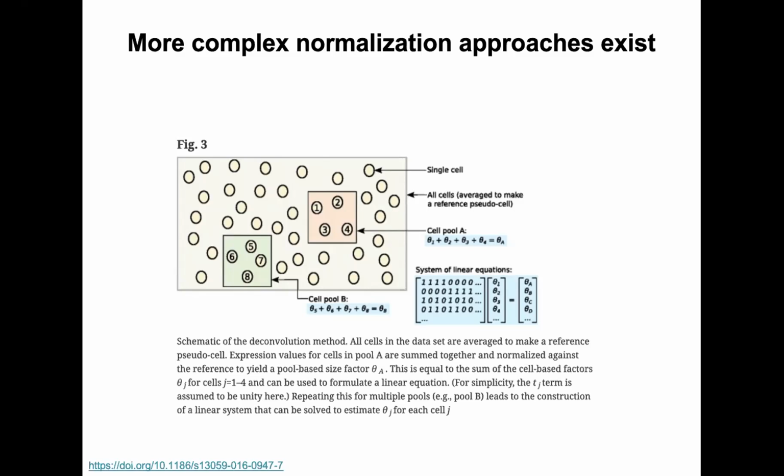It's discussed a little bit in that best practices tutorial. If you're interested in learning more, we're not going to really talk about it today. There's a number of these different strategies, and I would suggest that normalization is not just one thing, but there are a couple of ways to think about it.